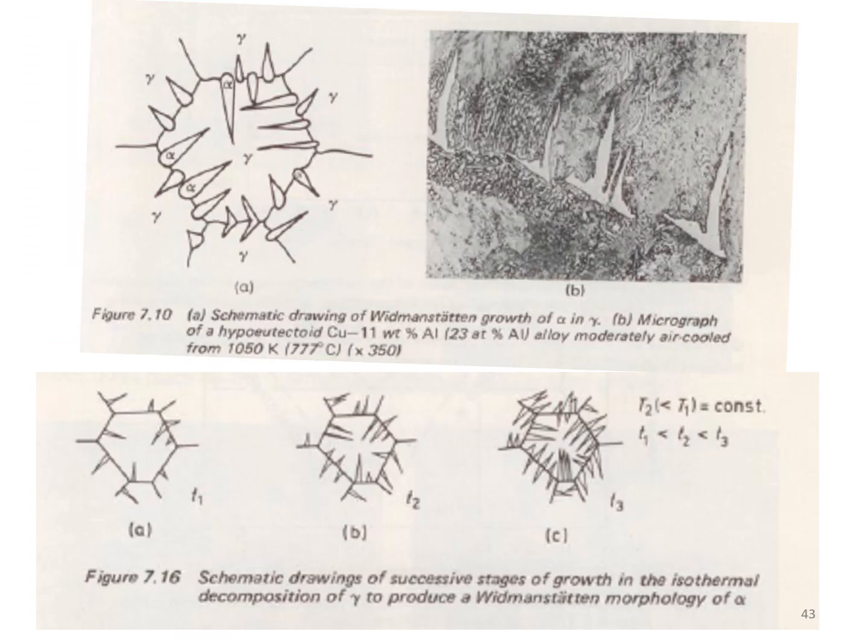It's quite complicated. But here again, we call this Widmanstätten, where you've got something on the grain boundary and then it grows in. So there's the grain boundary. Here it is at different stages. Why do things grow in from the grain boundary? Well, there's three reasons. One is that the composition is likely to be easier for that phase to grow because it was the last to form.